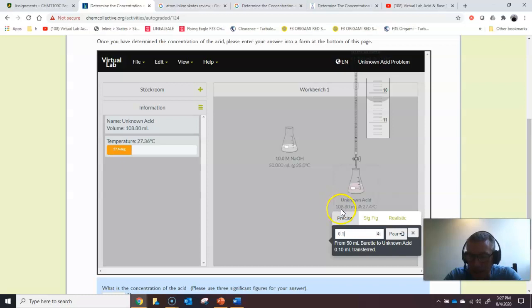It added 8.3 mLs. So the math would be, just to help you along, C1V1 equals C2V2. 10 molar, that's my C1, times 8.3 mLs, right? That's how much base I added. That's how strong the base is. That's C1V1 equals 100 milliliters, right? That's what I used, 100 milliliters of my unknown acid times X. And that should give you the concentration of your unknown acid.